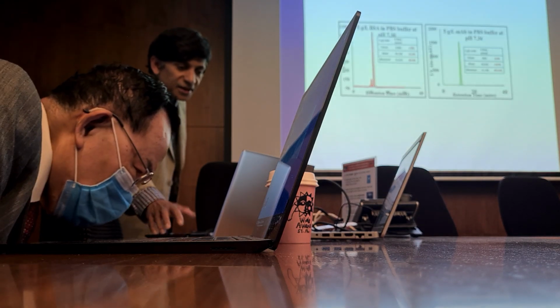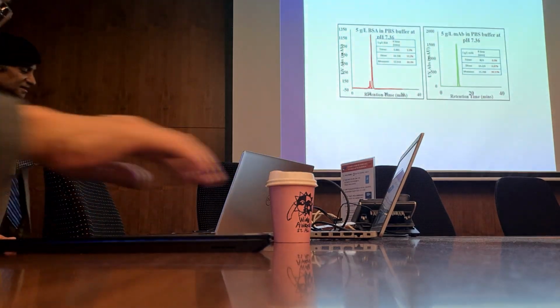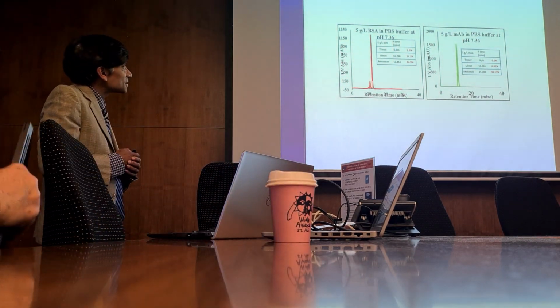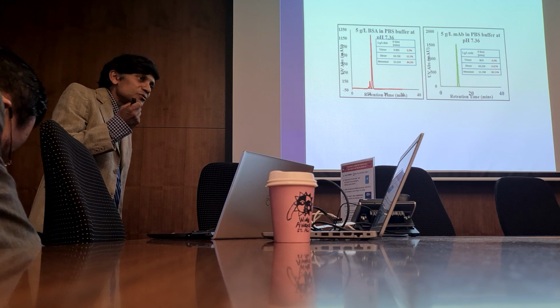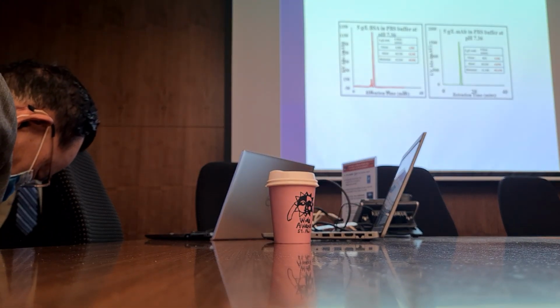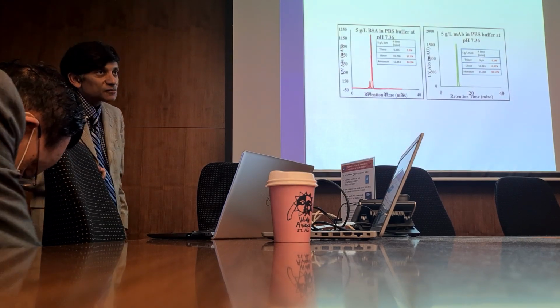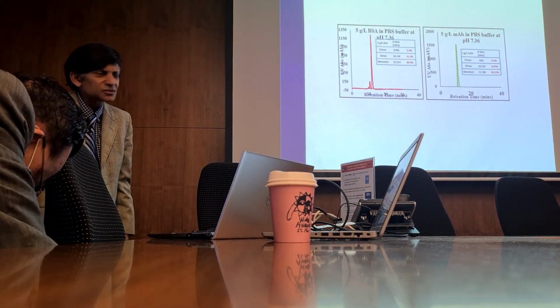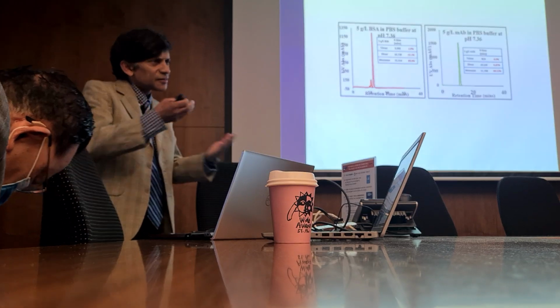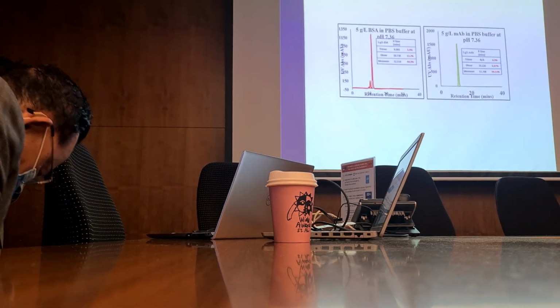Okay, we actually got quite interested in this and looked at something else. Some other things that occur in this area that are interesting: if you look at the operation of a virus filter, it's a little bit different to other sorts of membrane processes, in that if you get fouling, you sometimes get worse performance. You get virus breakthrough, which is odd, right? If you get fouling, you expect the flux to go down, but you expect not to get a drop in rejection, but you often do.